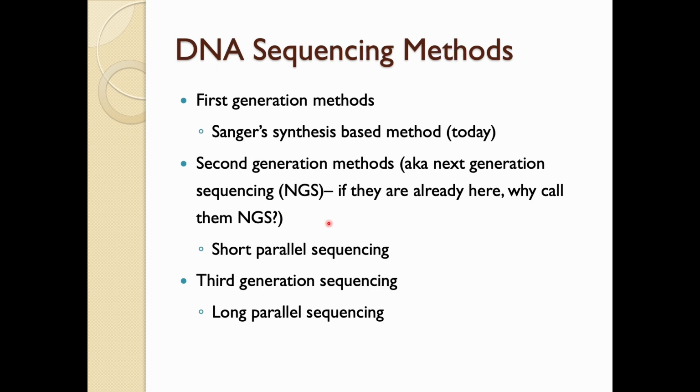There are 3 generations of sequencing methods. Today we will focus on Sanger sequencing, the first generation method. We will also talk about the second generation and the third generation long read technologies later in the course.